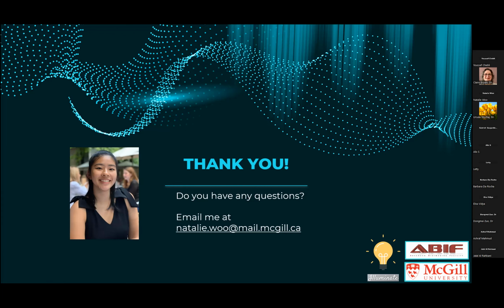But yeah, in an old lab, we used to make our own mounting media with propyl gallate that protected against bleaching. Yeah, that's what I was saying. Definitely. So you could probably add that if you need it.